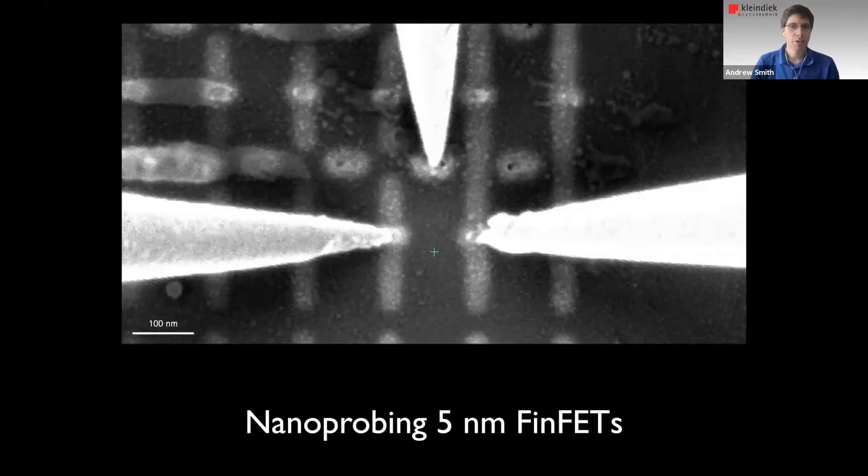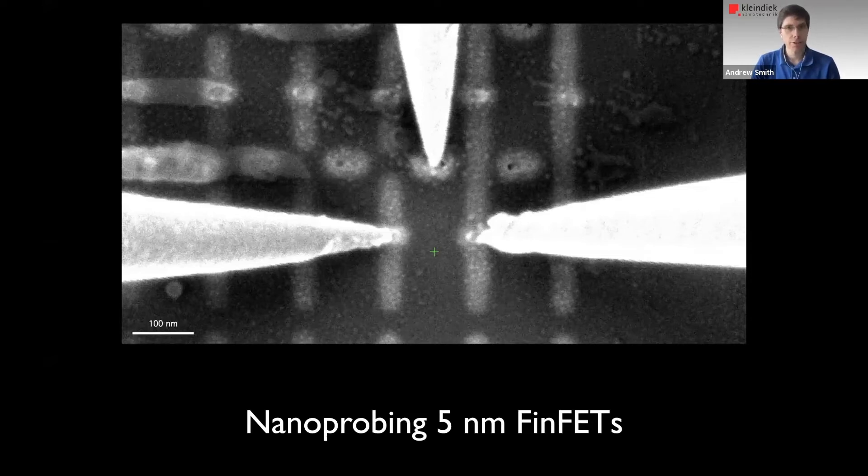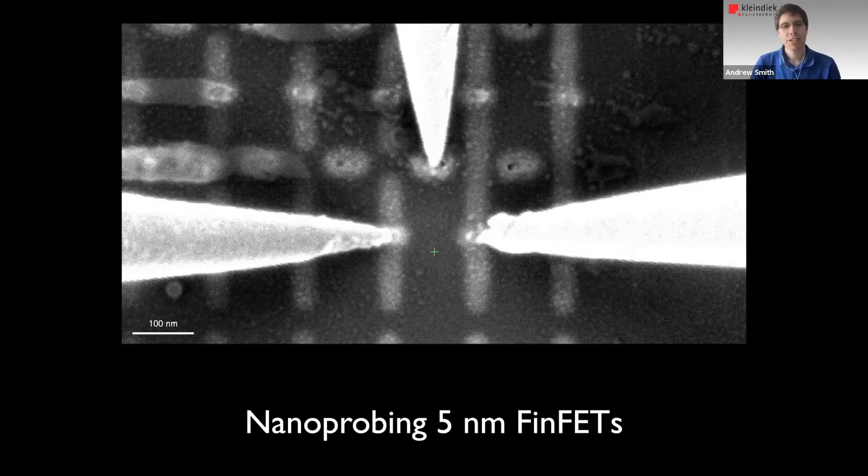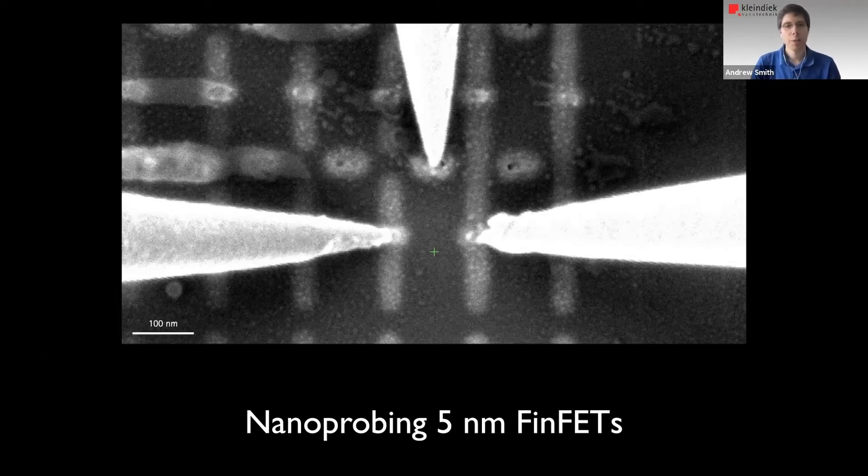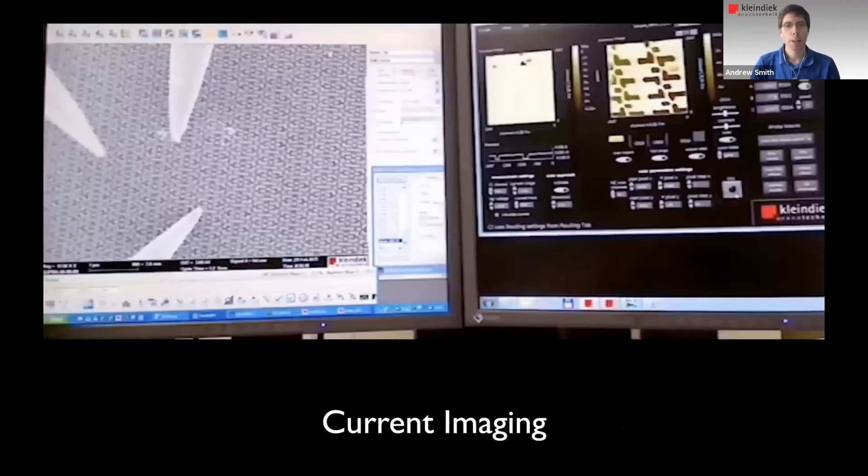So here's an image hot off the press. This is from last week. We finally got our hands on a 5 nanometer sample. It's hard to get these current and cutting edge devices because our users are very cagey about sharing images and information. So we have to wait until it becomes commercially available and then purchase one and process it and so on. But we're very happy that we finally have a 5 nanometer device that we can actually show images. So this is a simple transistor test.